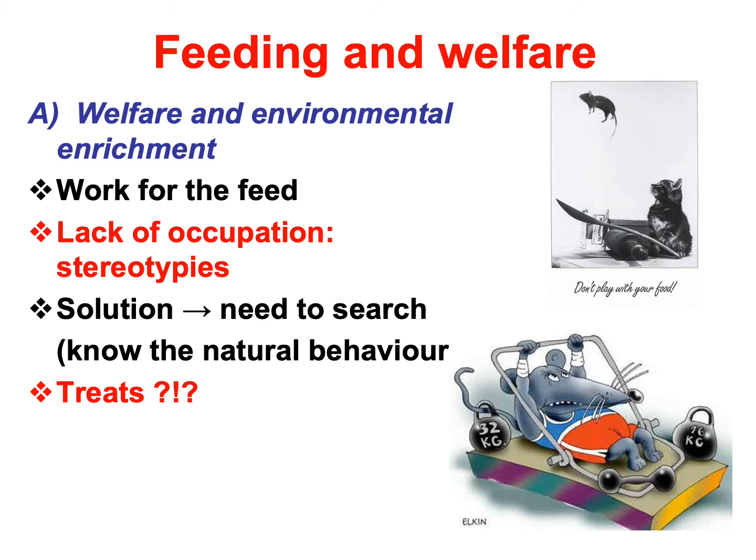Feeding and welfare. Welfare and environmental enrichment. We can organize that the animal should work for the feed, find it from the bottom, for example, from the bedding.